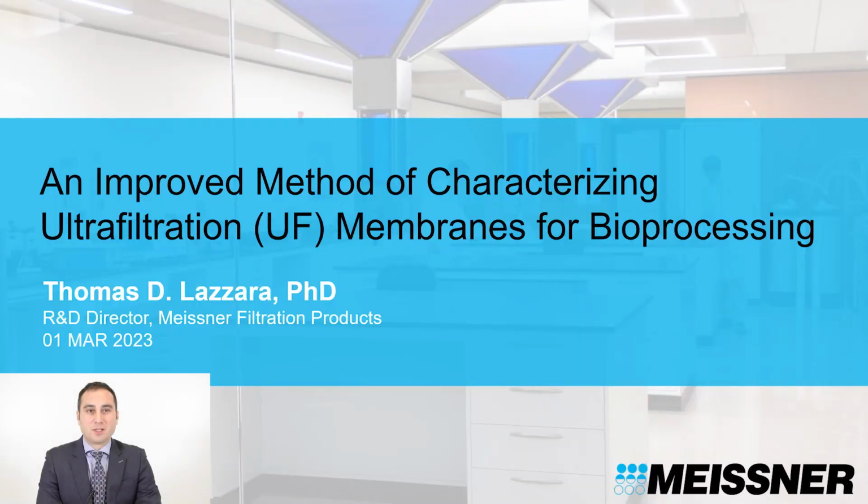My name is Thomas Lazzara, and I'm Director of Research and Development here at Meissner Filtration Products. Today, I would like to present an improved method of characterizing ultrafiltration membranes, specifically in regards to our hollow fiber product line, Sepropore.